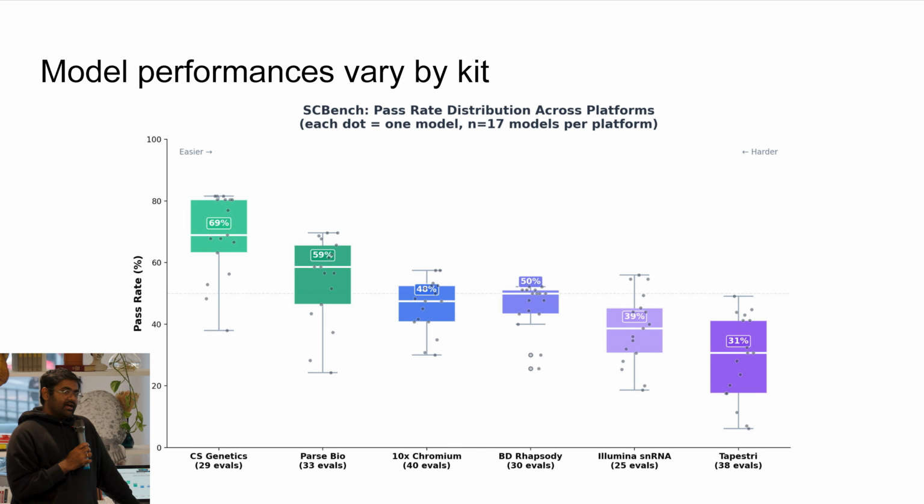One thing that I would still like to double-click on here is that we've been comparing this across different data sets with different complexities, and those are not really comparable across these models. So it could also be that some of these are more complex data, but despite that, we still see kit-specific artifacts, which we were able to observe when we analyzed the trajectories from a lot of these models.